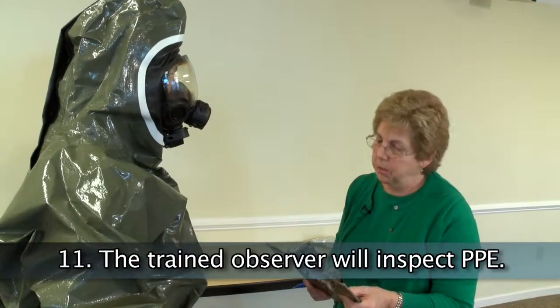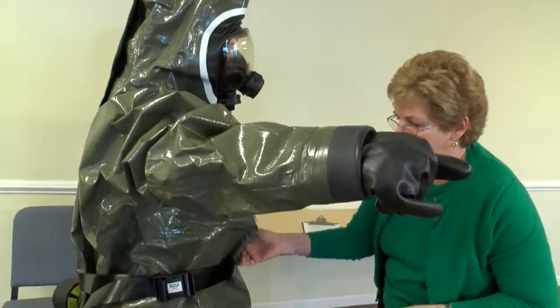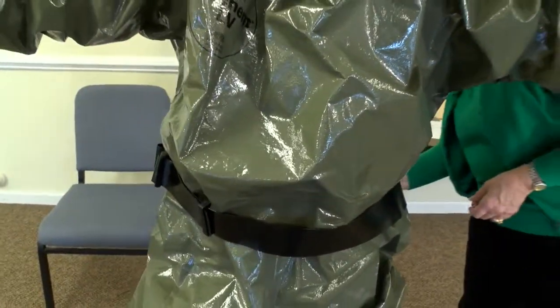Verify PAPR donning by the trained observer. This is the final inspection before the worker enters the work area. An overall inspection must be performed to ensure that all PPE is donned appropriately.